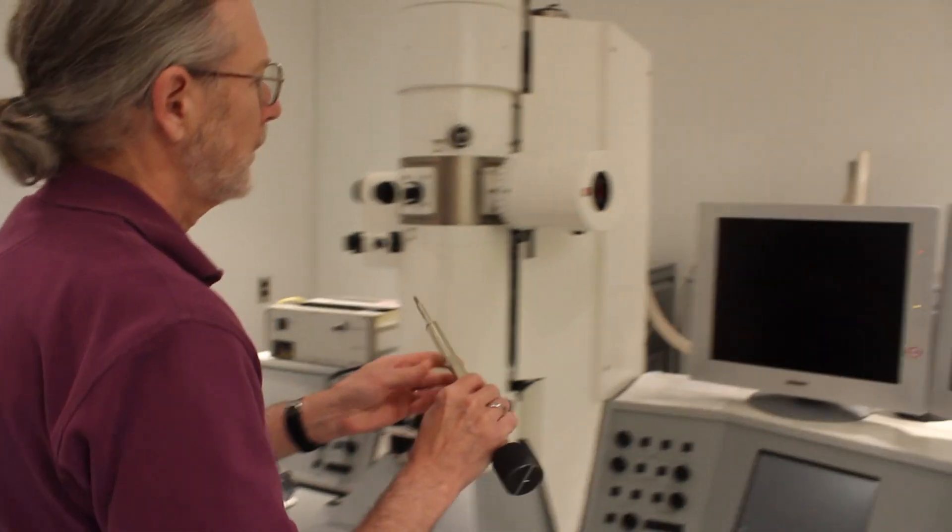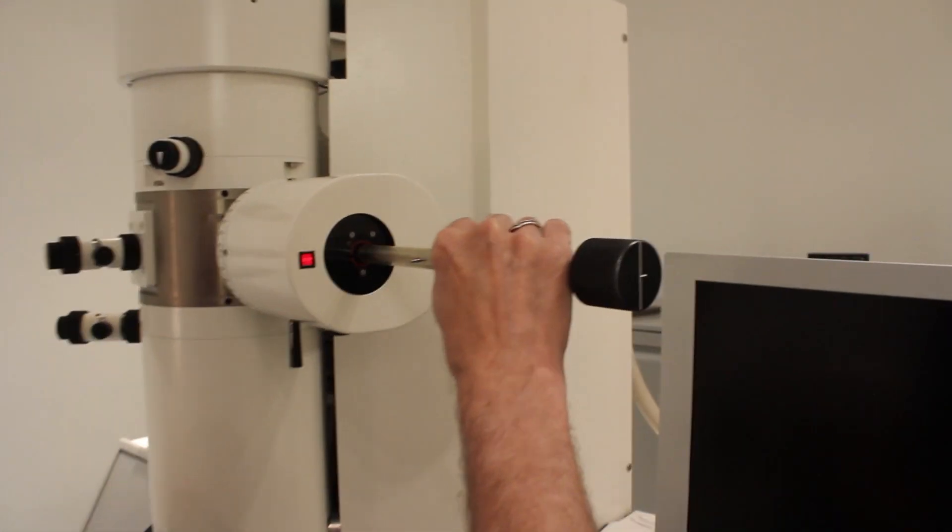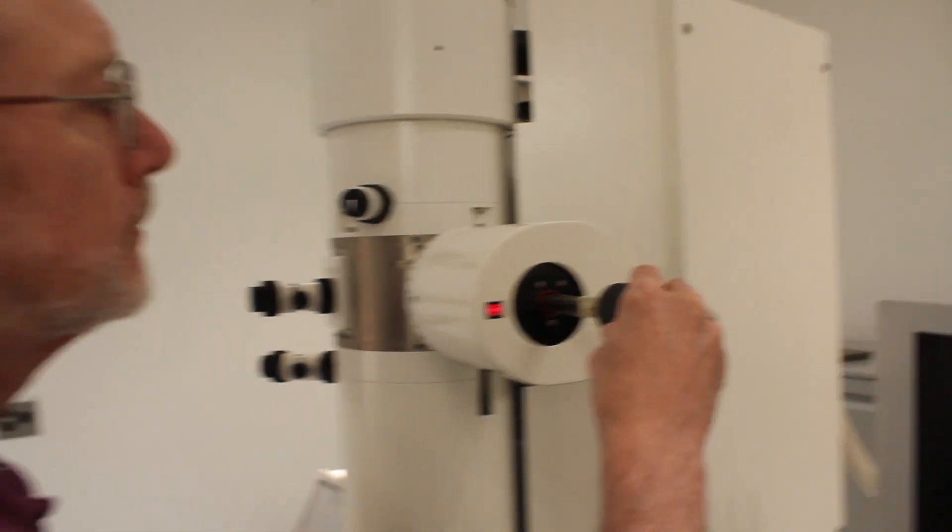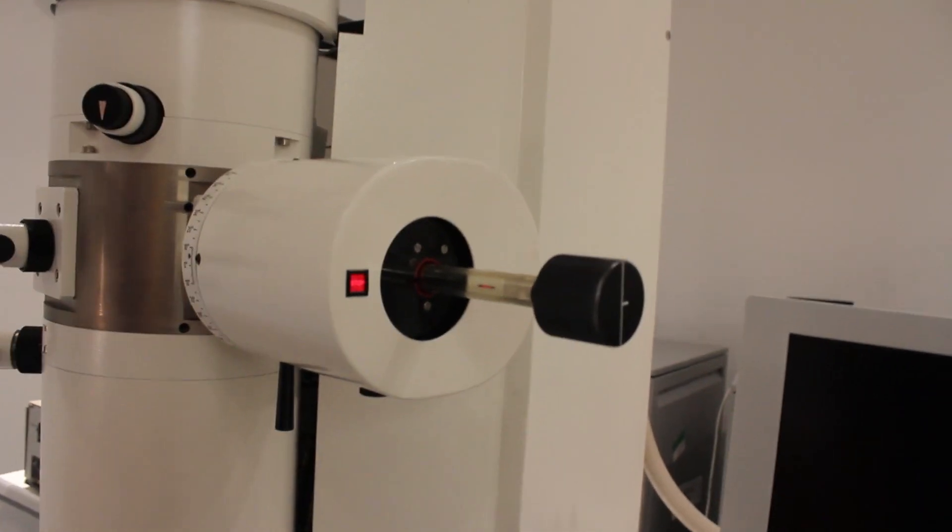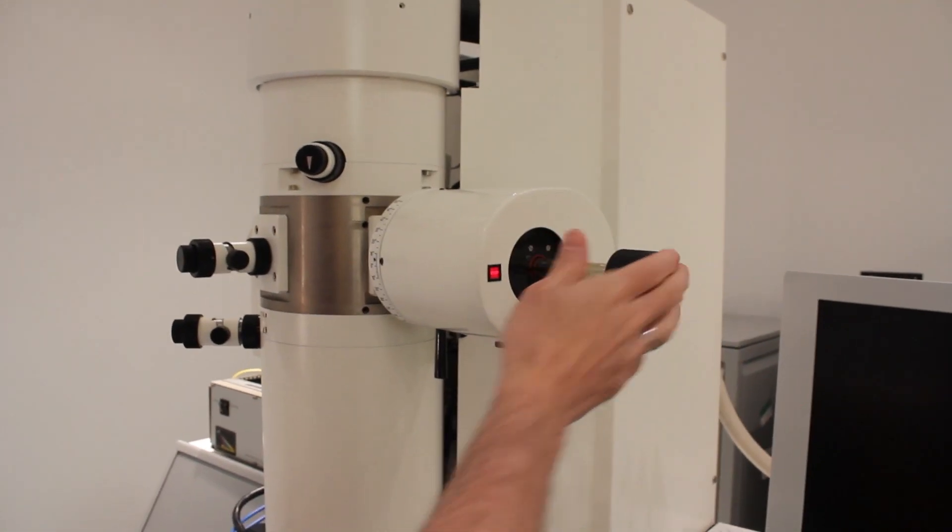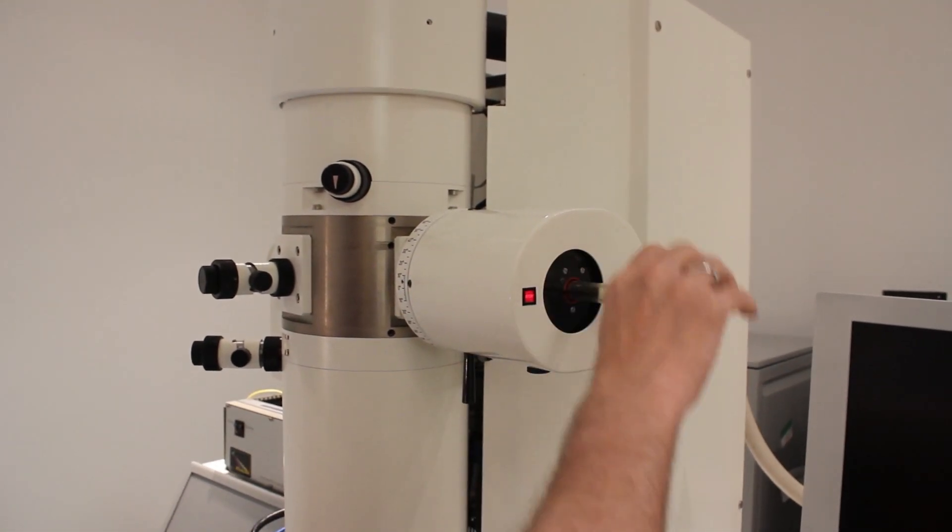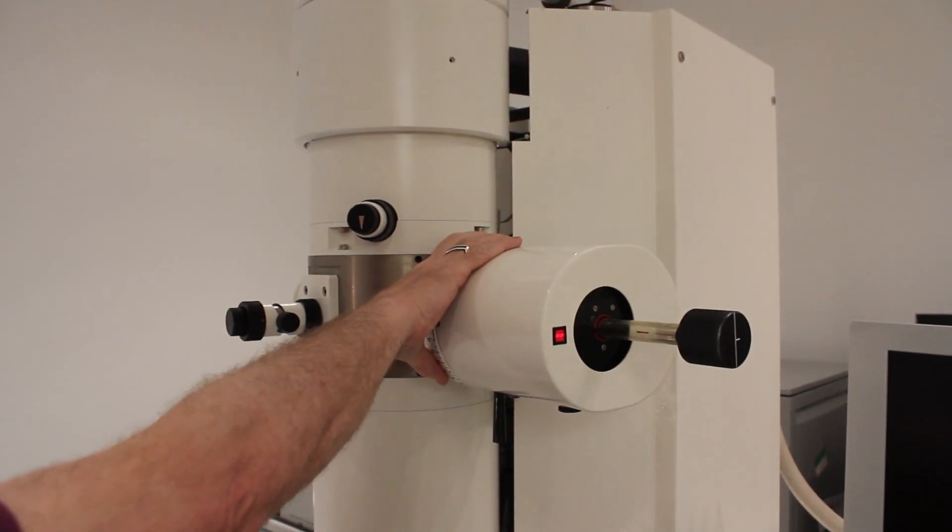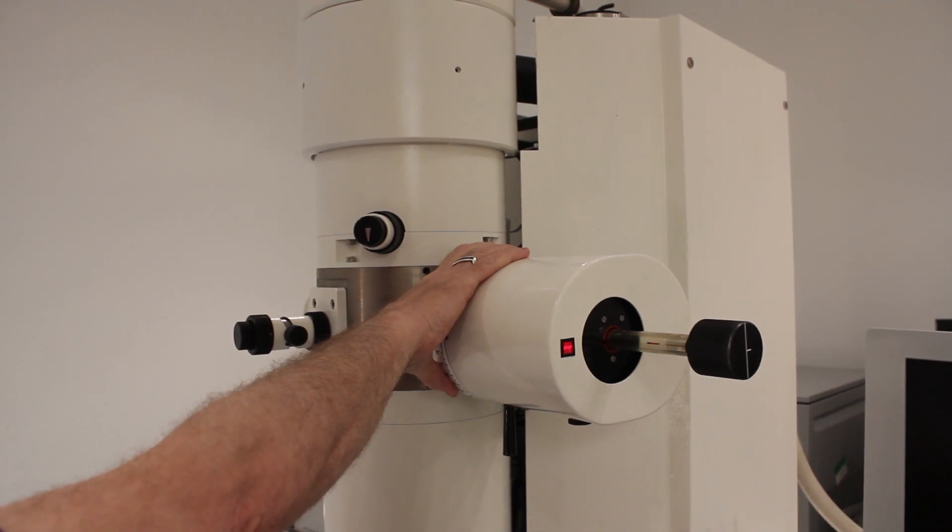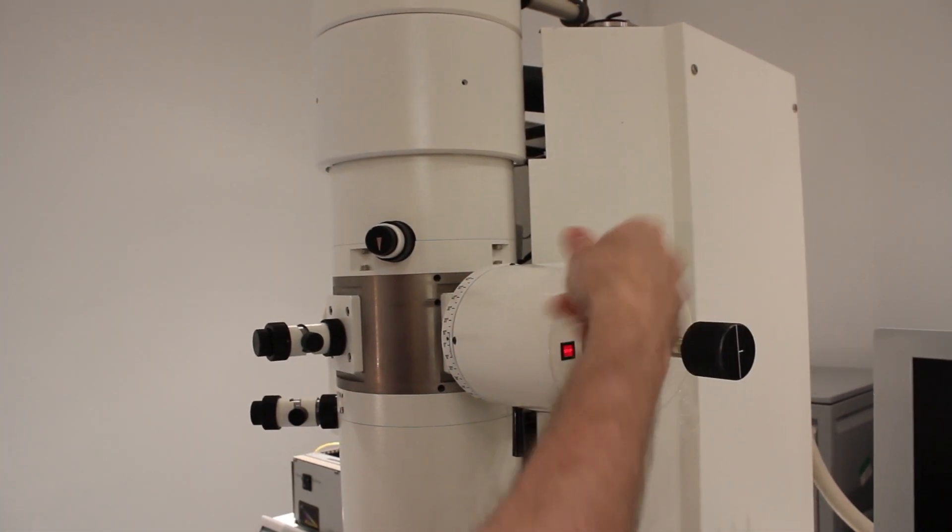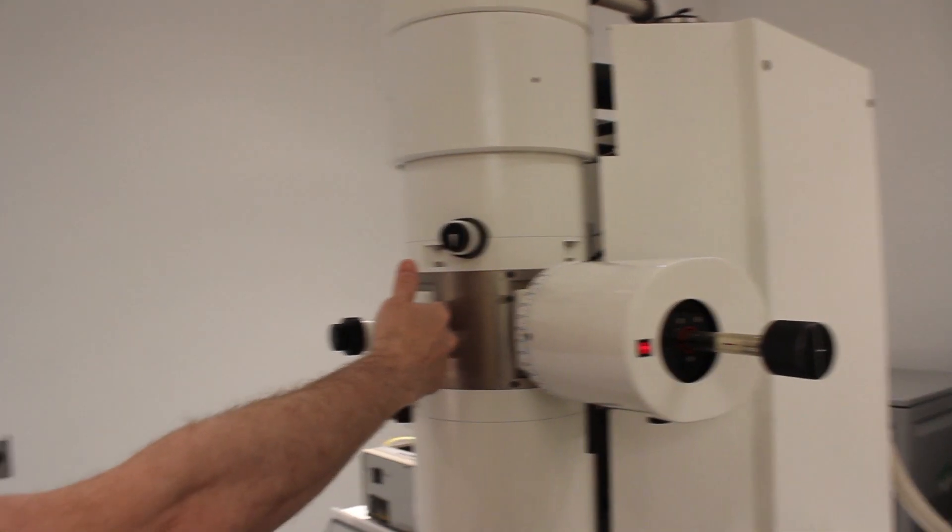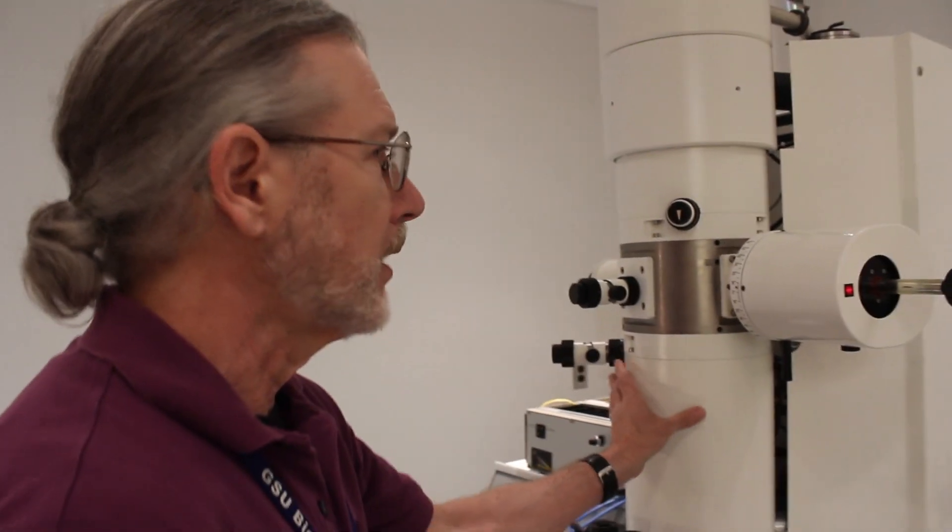Very interesting. So you would put the sample on there and then you would come and insert the sample. You put the sample back in here and if the scope was running... Do you feel like a pretty hardcore scientist whenever you're putting the sample in there? Oh, yeah. That's a pretty cool moment, isn't it? It's like, yeah, look at me with my science. You put it in here, you would rotate it, you'd pump the air out of this section right here where there's an airlock and then you would rotate it again and slide it into where it fits under the beam. So you always maintain vacuum in here.